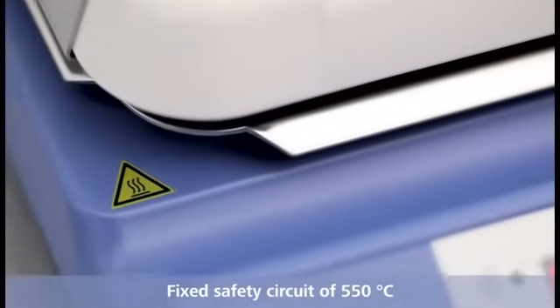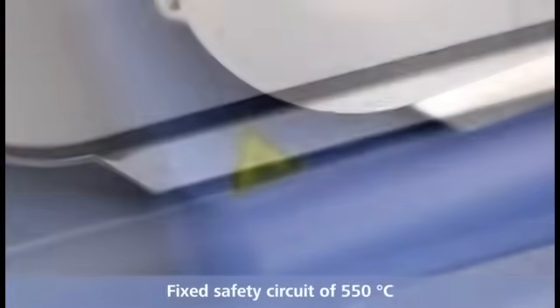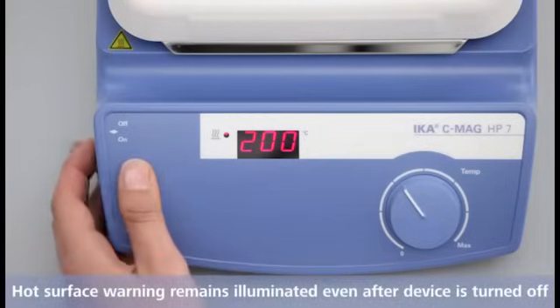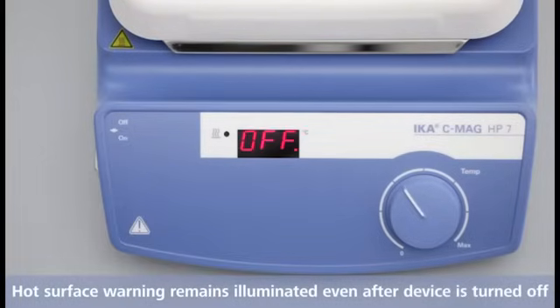Fixed safety circuit of 550 degrees Celsius. Hot surface warning remains illuminated even after devices turned off.